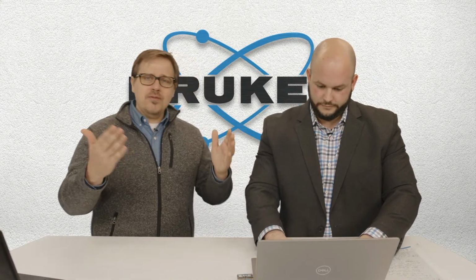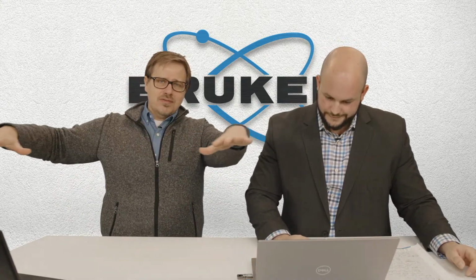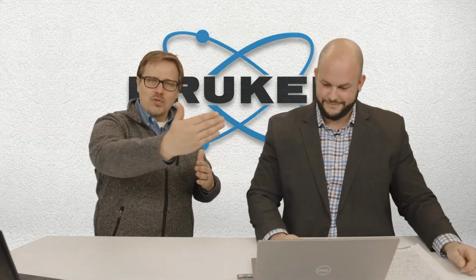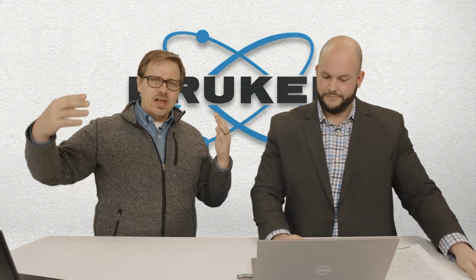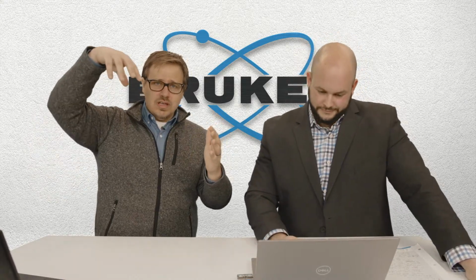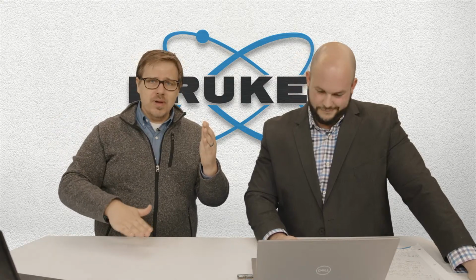The way I like to think about it is error space. Imagine if we have two variables that we're changing. It's kind of like having a trampoline. It's like having that nice flat plane. We have one variable on one axis, and another variable on the other axis. And now the errors, or the solutions, I should say, are kind of like sticking a bowling ball on the trampoline. So it's going to go down. We're going to get the best fit, the lowest error, at certain locations.